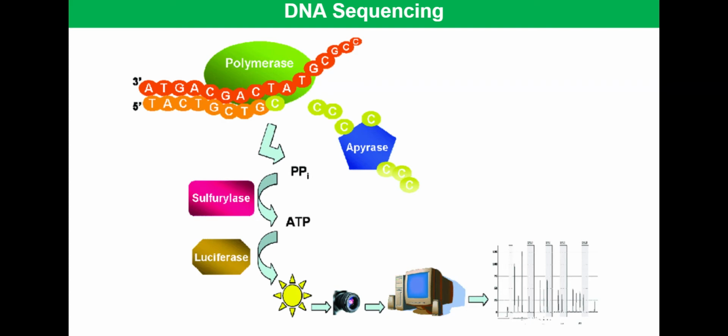It involves synthesizing a single strand of DNA complementary to the strand to be sequenced, one base at a time, whilst detecting, by light emission, which base was added at each step.